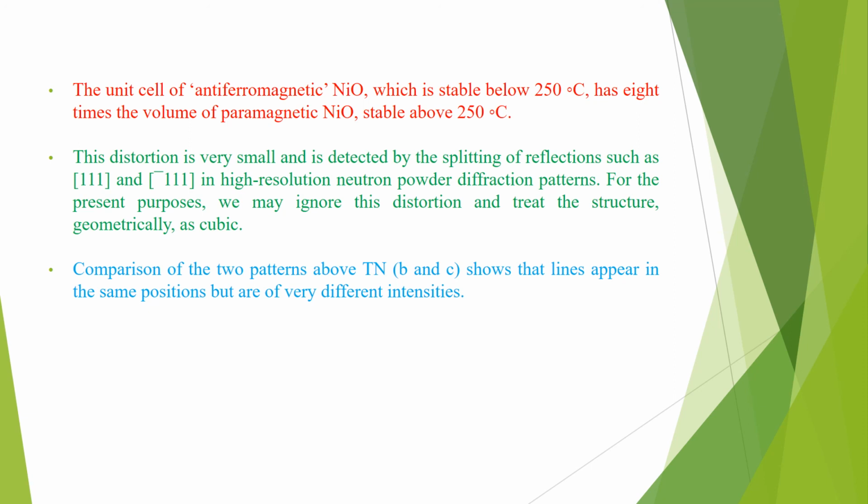Comparison of the two patterns above the Néel temperature Tn, B and C, shows that lines appear in the same positions but are of very different intensities.